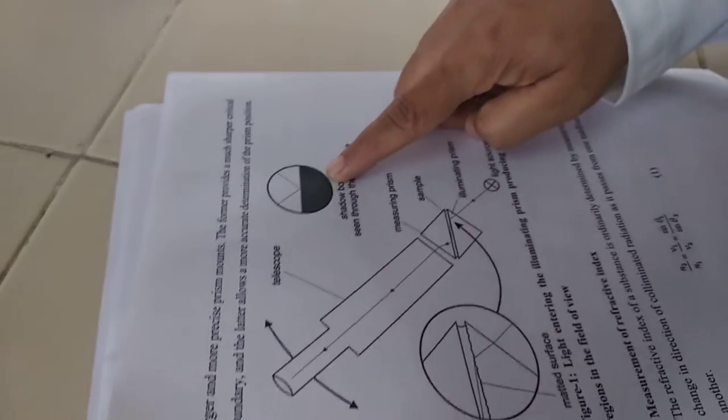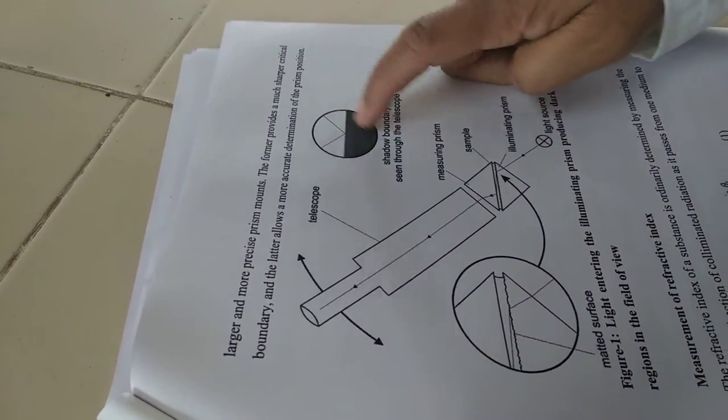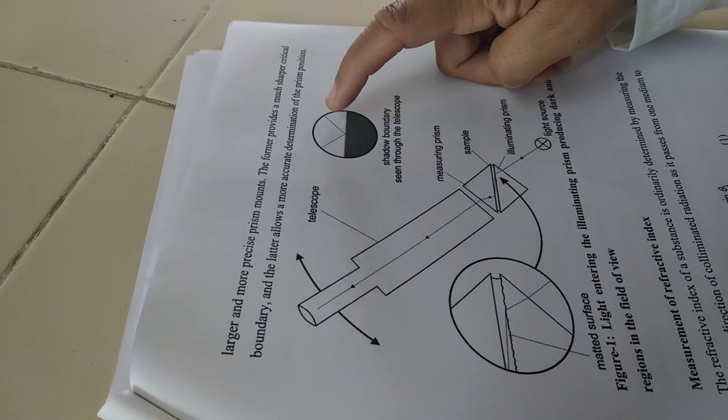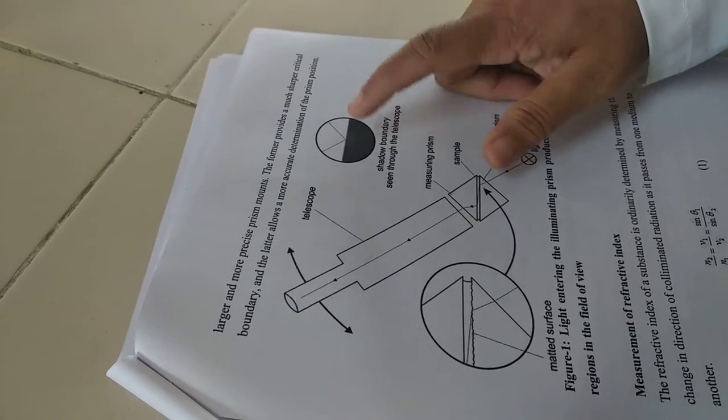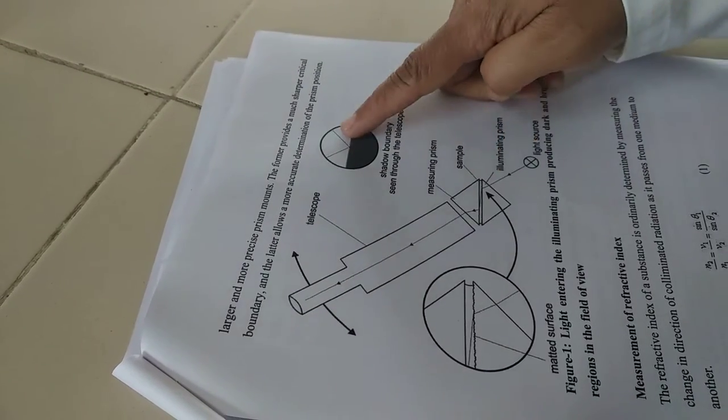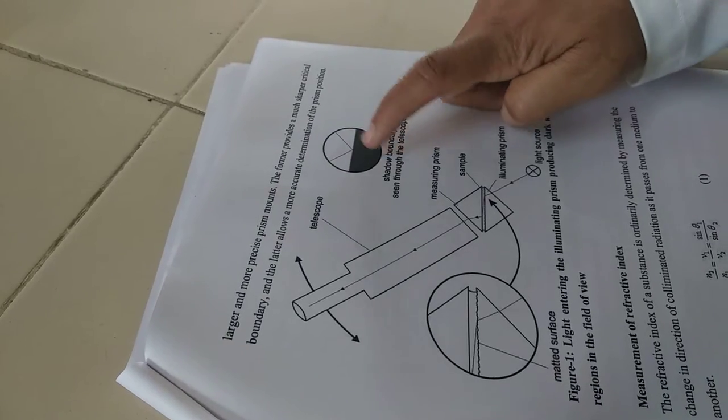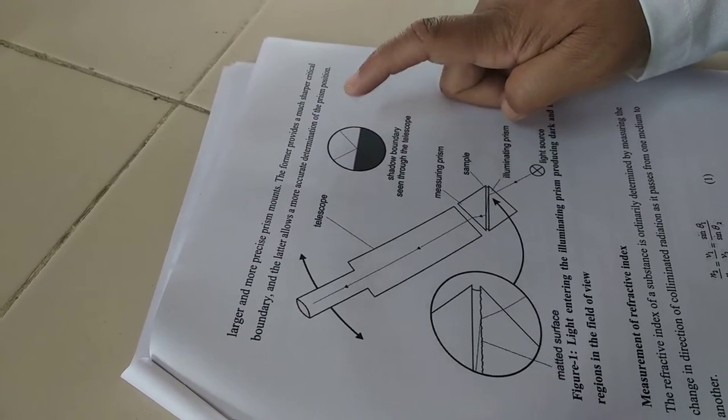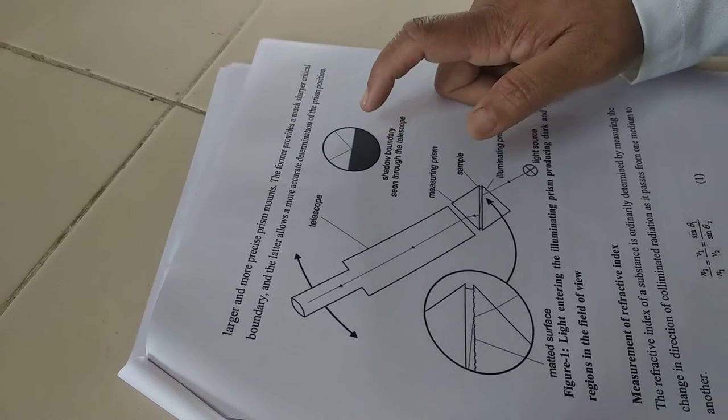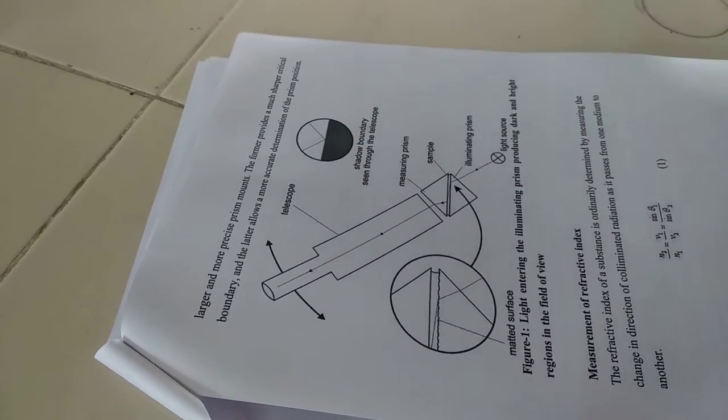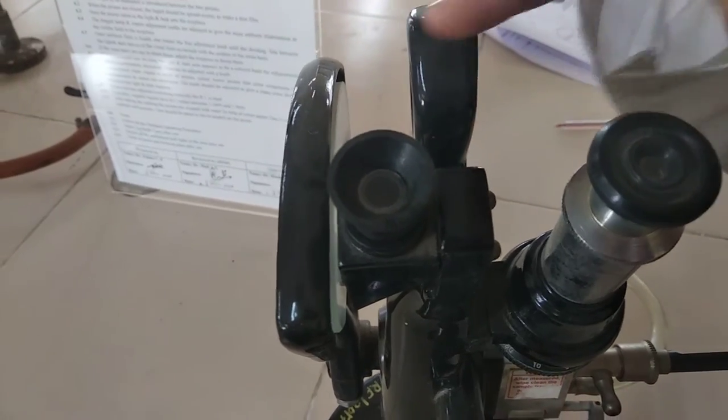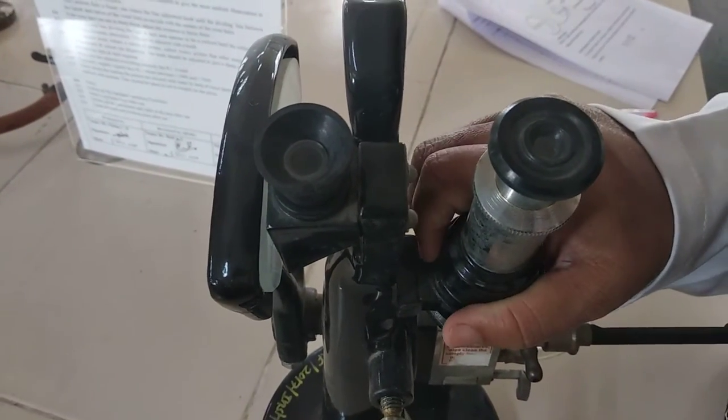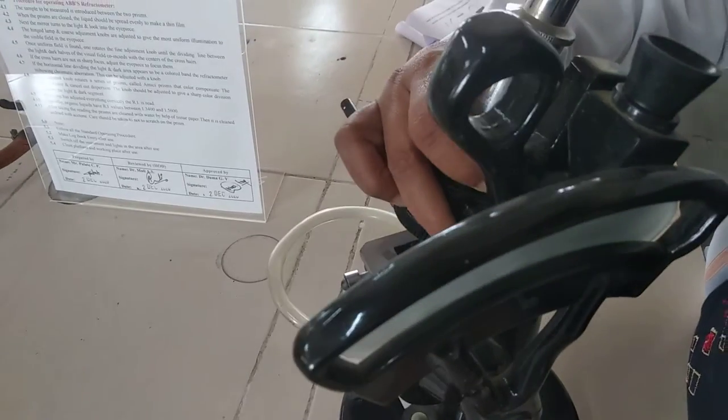Just see, like this picture. Here, one cross line will be there and always this dark portion and light portion, this should be 50-50 percent or half of this circle. We have to adjust our mirror or we have to adjust our sample like this only. And afterwards, we can measure our refractive index by using this instrument.